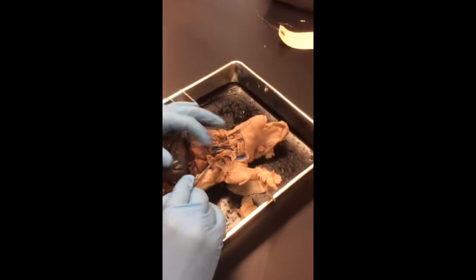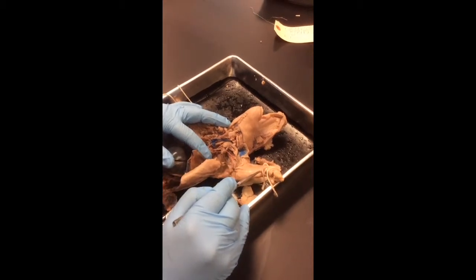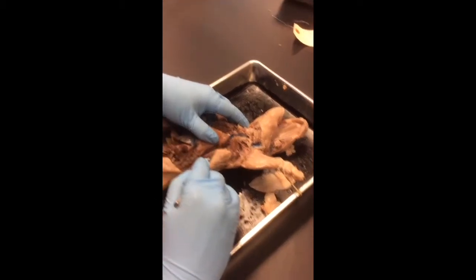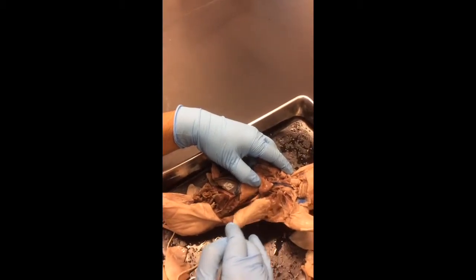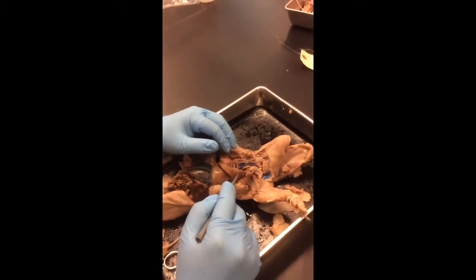Subclavian vein. Mine doesn't have it, but it's going to go into the arm. So if you see a blue vein going into the arm, subclavian. Azygous vein is in the back. Mine's not very good, but you can kind of see it right here. It goes down from the heart, along the aorta, down the back. That's the azygous vein, and it drains the back. Hepatic vein, don't worry about.